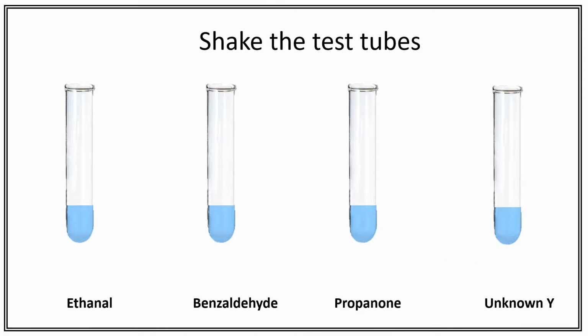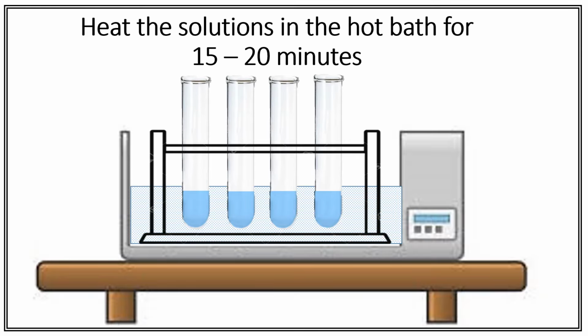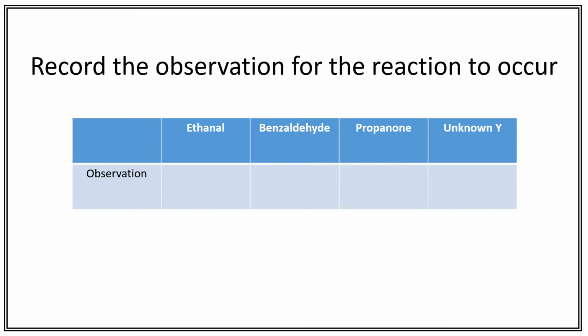Shake the test tubes. Heat the solutions in the hot bath for 15 to 20 minutes. Record the observation for the reaction to occur.